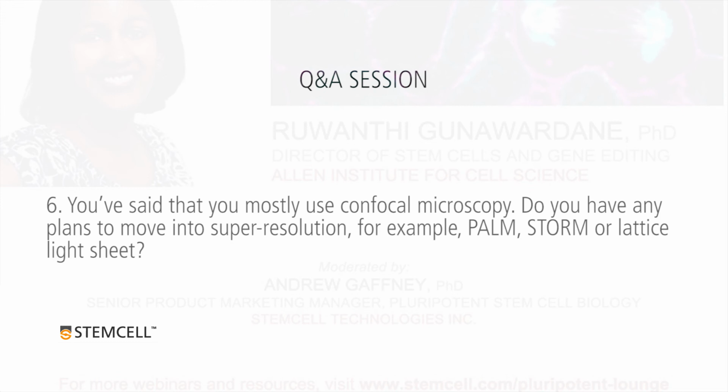It depends on the question we want to ask. So we are always keeping those in mind and are in conversations with vendors who are building more pipeline compatible instruments for those, because a lot of those things that you just mentioned are mainly used by institutes or labs working on one or two things. We have a pipeline going where we're creating lots and lots of images and using stem cells, which are a little bit more finicky than some of the other cell lines. So we're trying to figure out what the best modality is and having multiple options depending on what we want to study, because certain dynamics are going to be faster than others. So some of it comes down to timing.